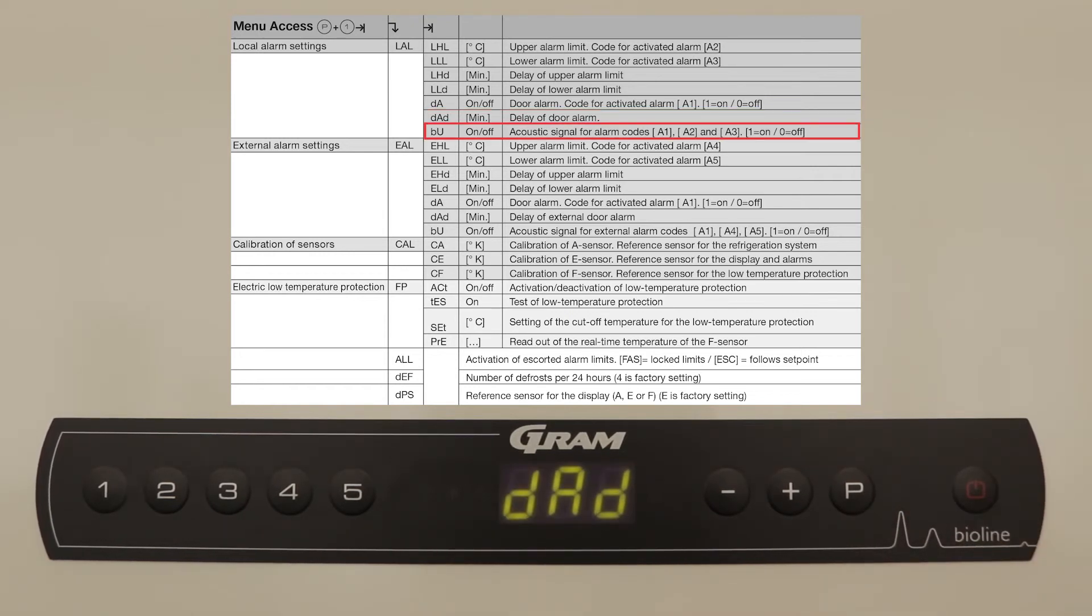We will now set the acoustic signal. This, like the door alarm, has an option 1 and 0. We will set this to 1 being on.